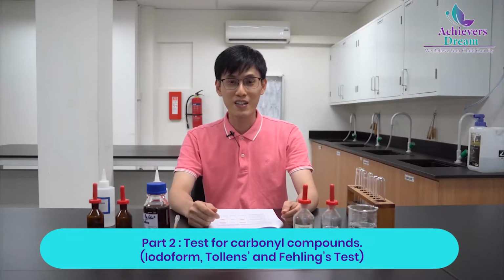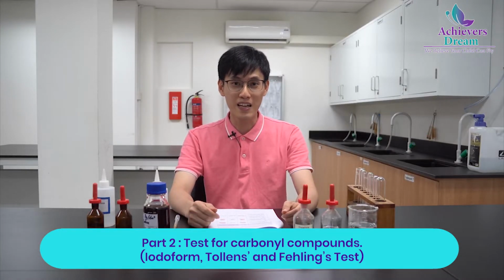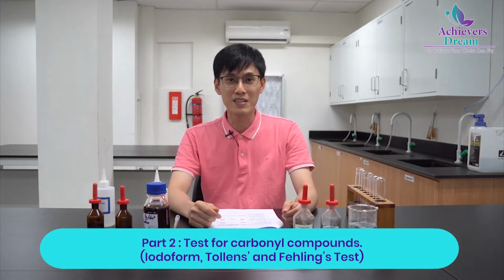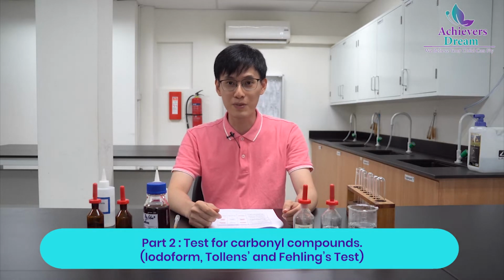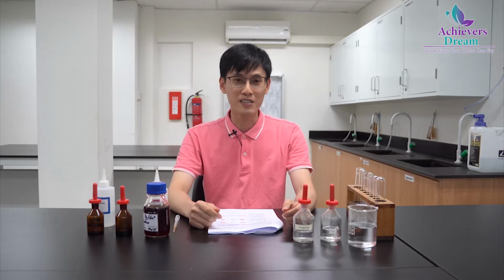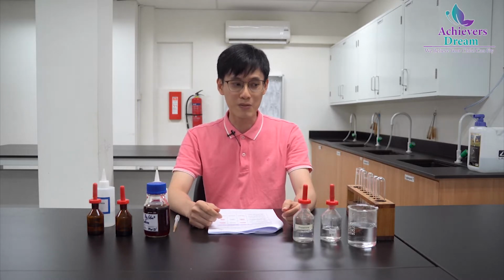Okay everyone, still on experiment 9, organic qualitative analysis. We are looking at test 4, which is about the distinguishing test for carbonyl compounds. We will be performing 3 main tests, which is the iodoform test, the Tollens' test, and the Fehling's test. These are 3 of the important tests that we need to know for carbonyls.